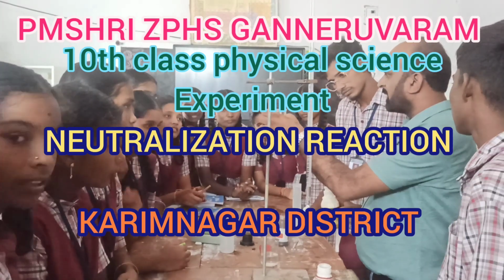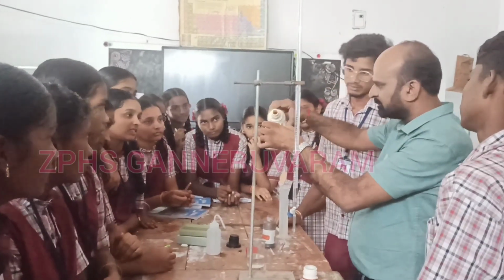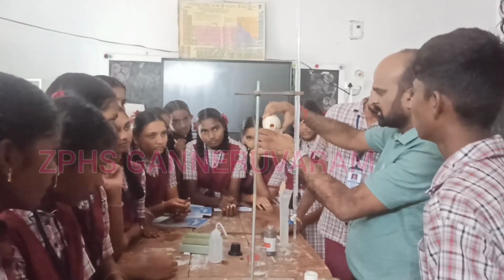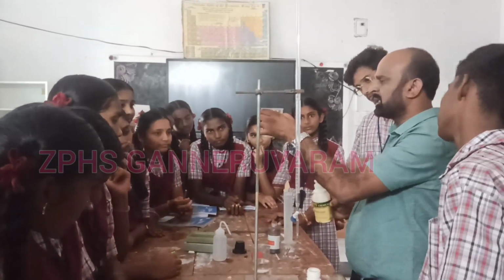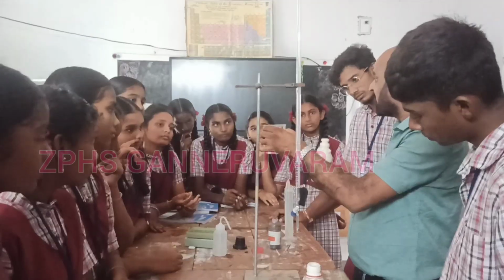Now I have taken one beaker with some water. In the water I am pouring or adding hydrochloric acid. Just hydrochloric acid I add. By adding the hydrochloric acid, it forms what solution?